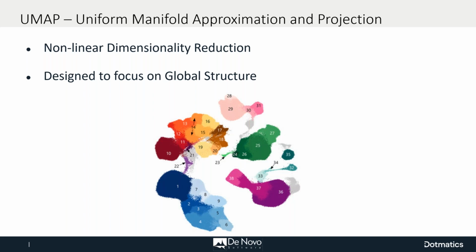So it can be harder to realize if there are compensation errors, unmixing errors, scaling errors, if there's still population artifacts like debris, dead cells, doublets, antibody aggregates. Those are all harder to detect after you're looking at the results of these algorithms. So I want to emphasize really quickly to make sure that you're putting clean data into these algorithms.